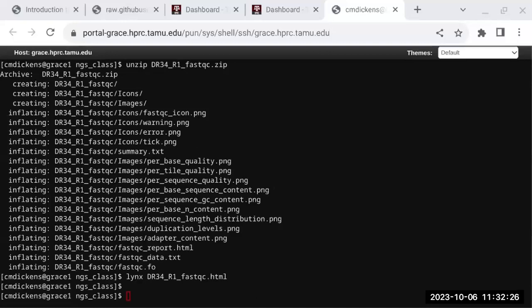These kits, in the past, they expired. I think now they don't have an expiration date. They don't have to be refrigerated or something. But this was a kit that we had in the refrigerator that was given to us for training, but we didn't use it. And then we decided to use it like 9 months after it expired to see what it would look like. And this is what happens. So chances are you won't see that. Here's something else.